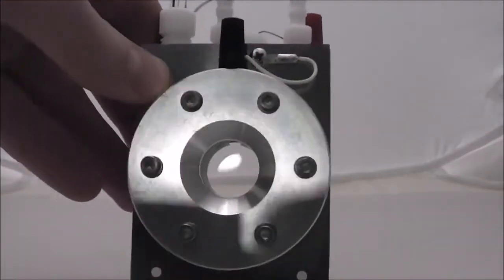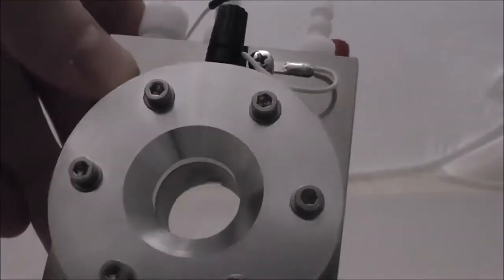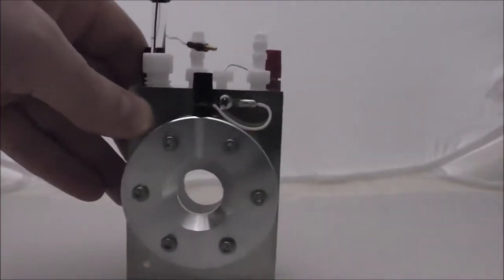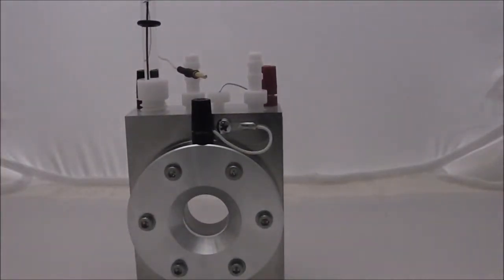You can put the liquids into the cell. It's actually designed to go with the SIMPS systems from Zana. Zana is a real leader in photoelectrochemical type experiments.